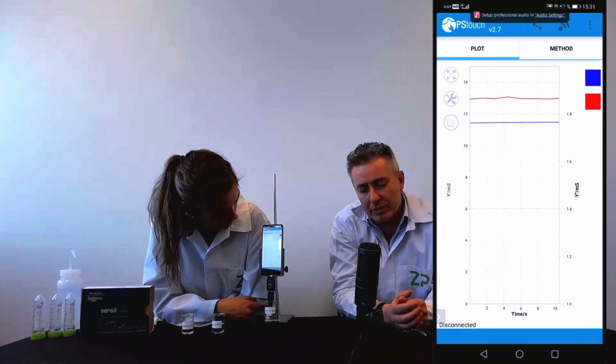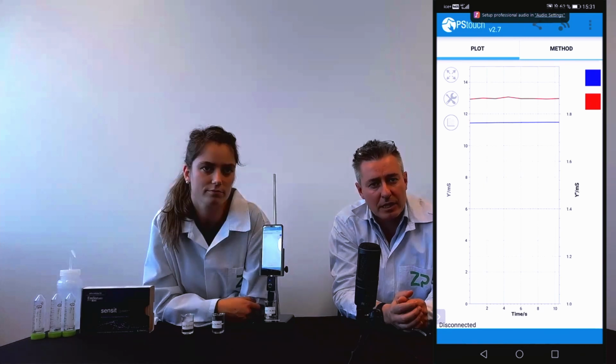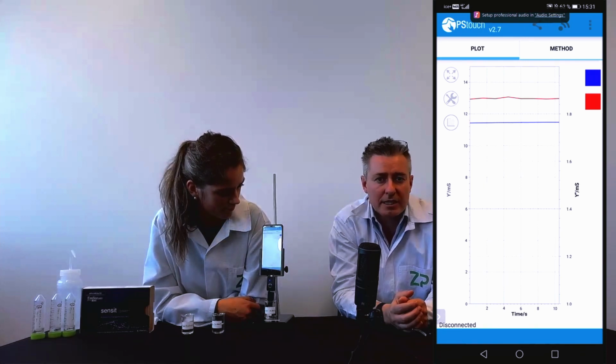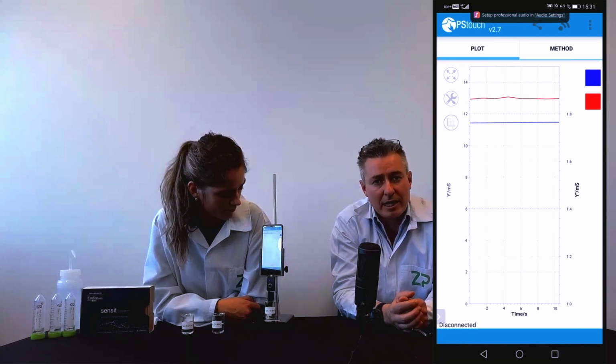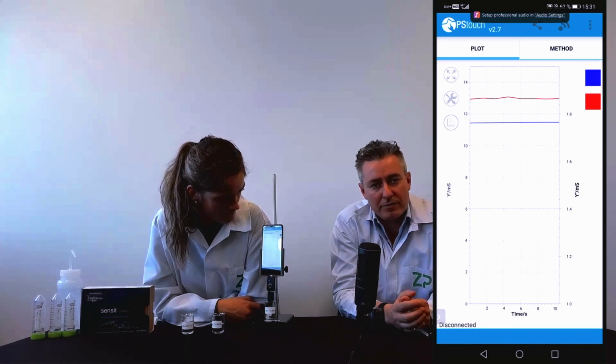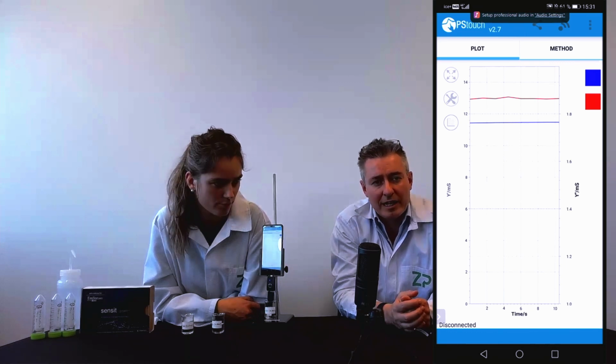As Solron runs this one, 50 millimolar is kind of interesting because blood, if you ever taste it, you can tell it's about 150 millimolar sodium chloride. So the 50 millimolar now is more representative of the kind of conductivity of blood. And there's an interesting measure in the conductivity of blood. If you do that, you can start measuring something called hematocrit, which is the ratio of liquid to red blood cells. So there's a medical application for this as well.